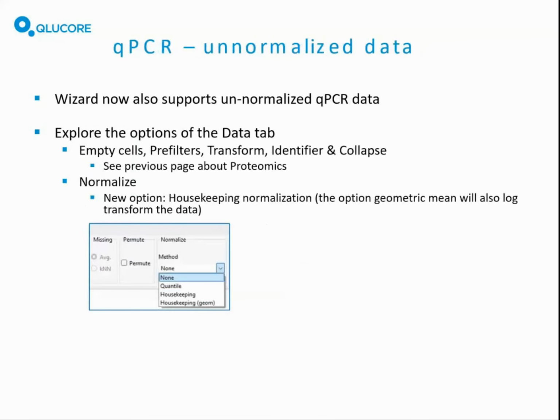For qPCR data, we can now handle also unnormalized qPCR data. There is a new normalization option, housekeeping normalization, and I will demonstrate how you can work with that when you have qPCR data.